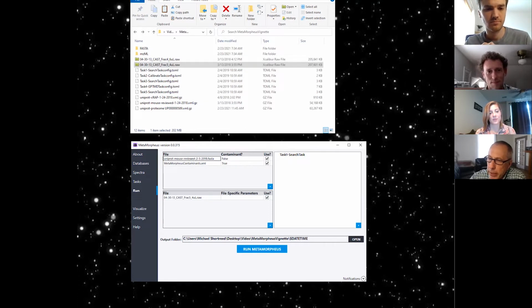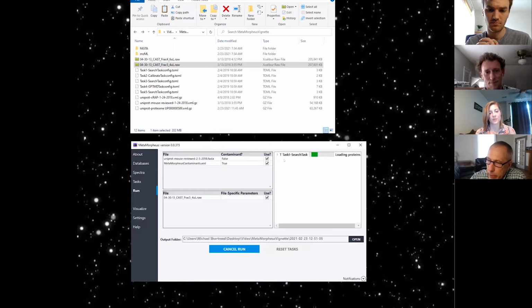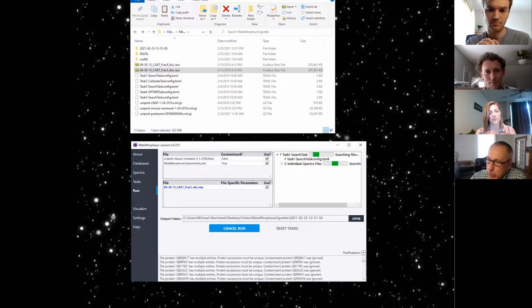We have databases up here, raw files on the left, and then all of the tasks. You can add as many as you want. They'll just run in order and pipe right into each other. Here we have just the one, and this is showing you where the data file is going to be. So I'm going to hit run, and you're going to see real-time search.